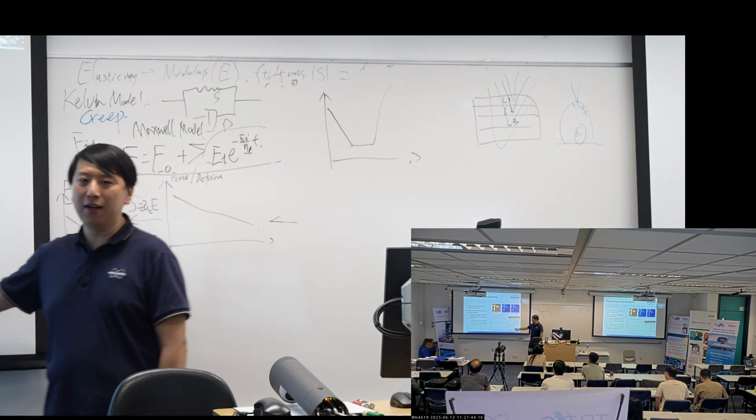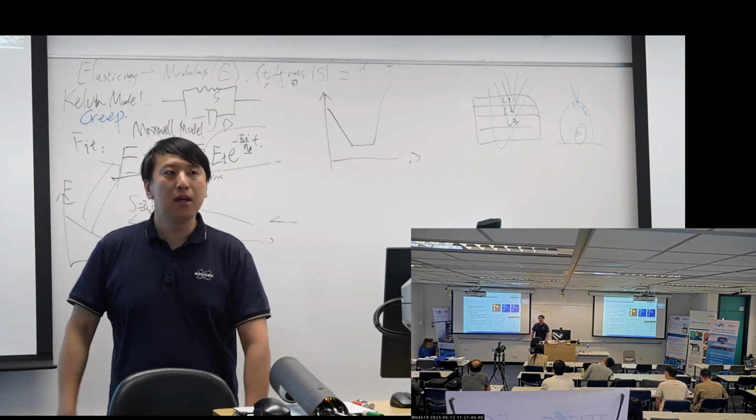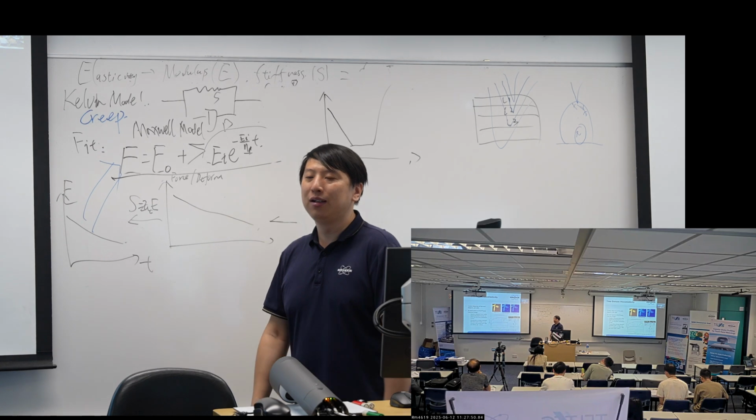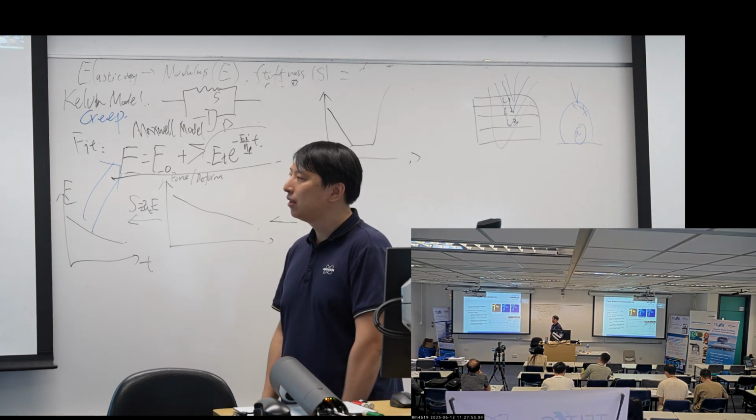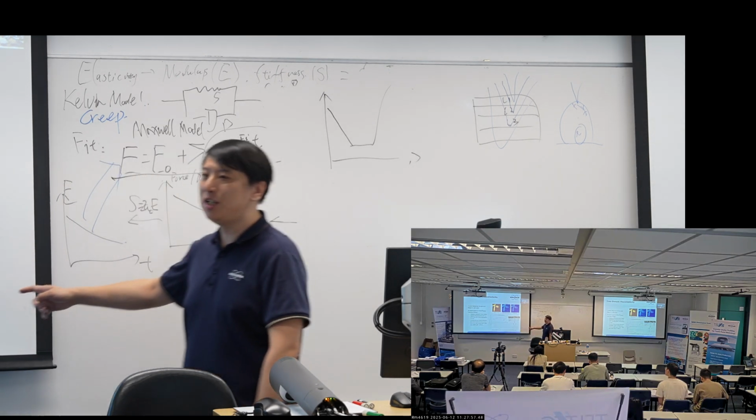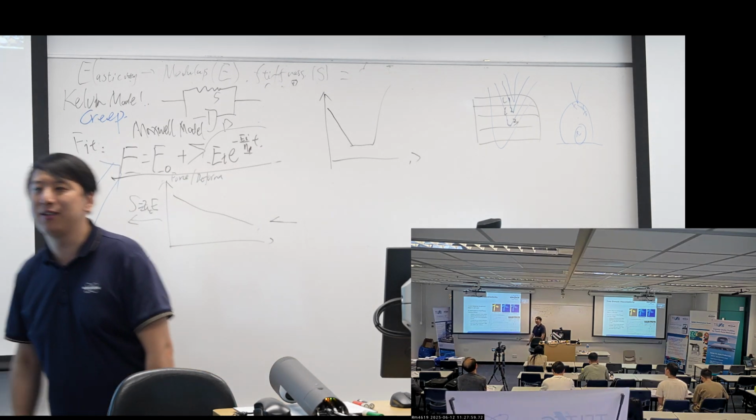Of course, this k means nothing to them, but the exponential lifetime term means something, because this time term won't change due to our data processing.